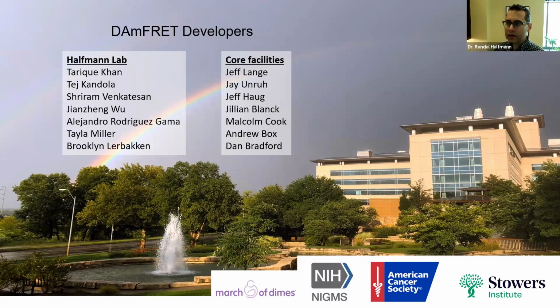And so, because you're looking at the difference between high and low FRET and not necessarily the actual final structure, all your mutations are really probing are the residues that are absolutely required, right, to form that structure. So what is the core? And the core, but the kinetically most important things that have to happen to form that amyloid.